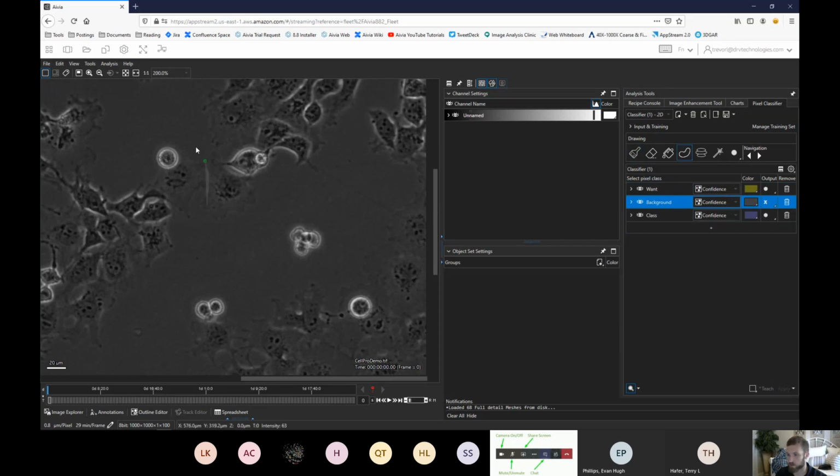And I can define a swath of area here. And then go inside that and maybe paint these separately. So I'll paint these things with these bright double membranes as blue. And then I'll paint these other highly structured things as yellow.